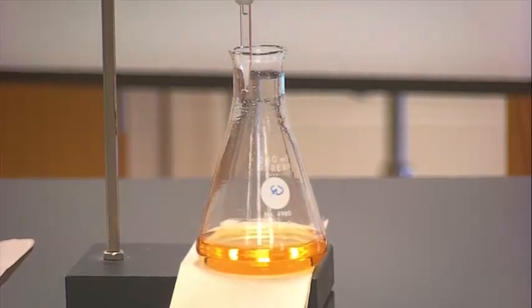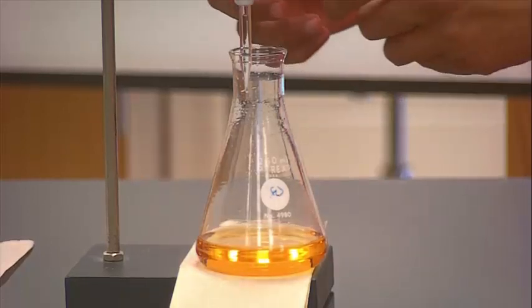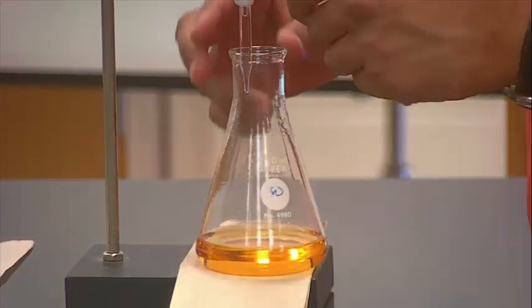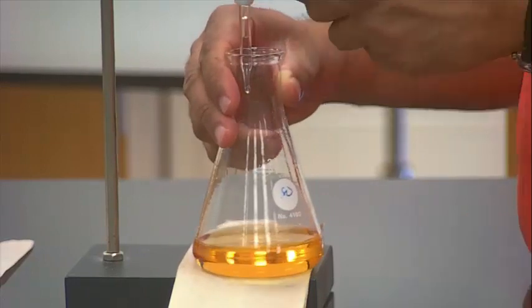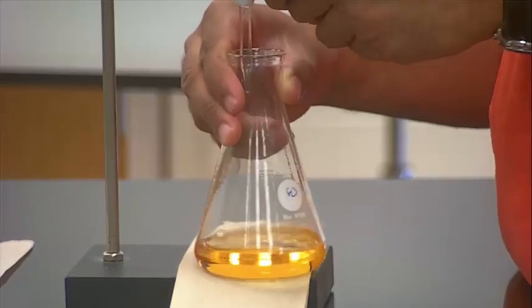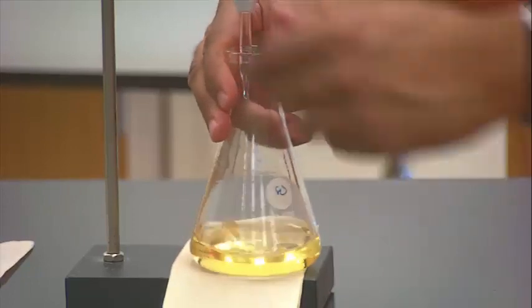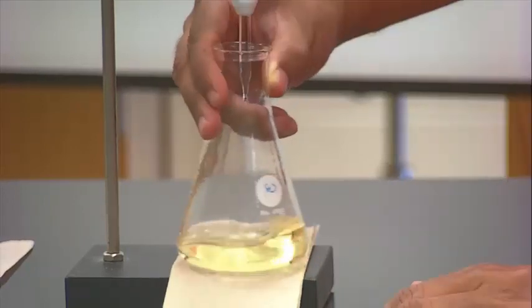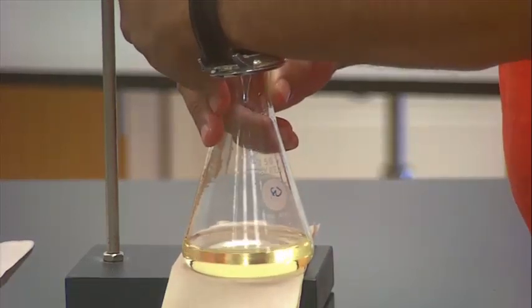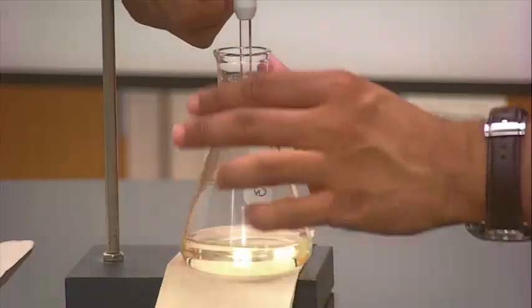Okay, this is what's called the exact point in our titration. So this is where you want to fine tune and just go 1 drop by 1 drop. So let's go ahead and do that. Be very, very patient when you do this, drop by drop. As you can see here, my yellow is really getting fainter and fainter. So this is where I really want to fine tune. All right, so I'm almost there. A couple more drops.